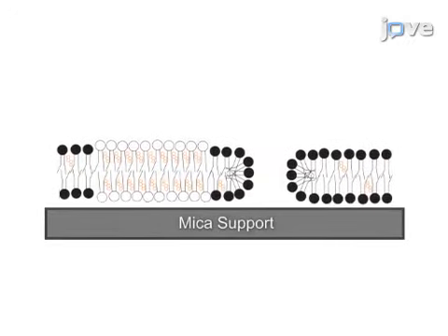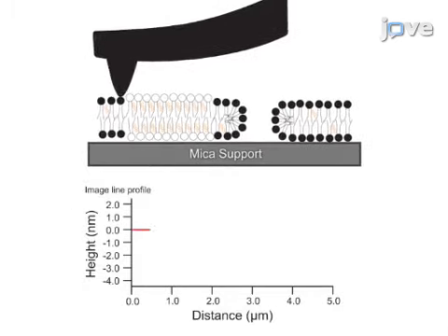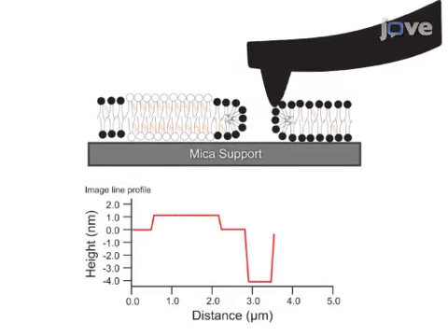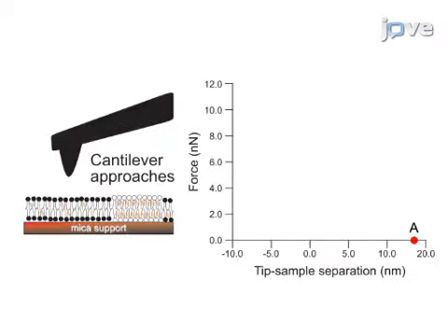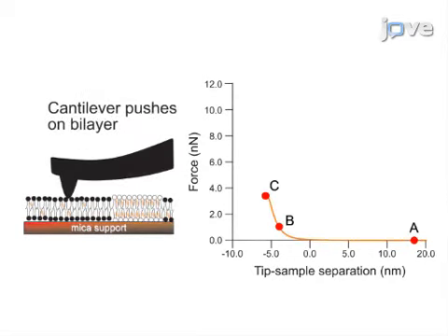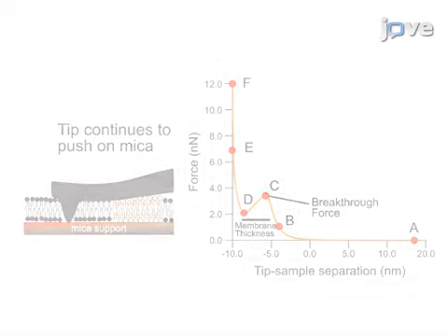Next, the supported lipid bilayers are prepared by depositing the liposome suspension onto a mica surface. Using atomic force microscopy, the surface of the bilayer is then scanned, producing a topographic image where structural features like height can be measured. Next, force spectroscopy is performed on specific areas of the bilayer to probe the physical properties of the bilayer, most notably the breakthrough force and membrane thickness.